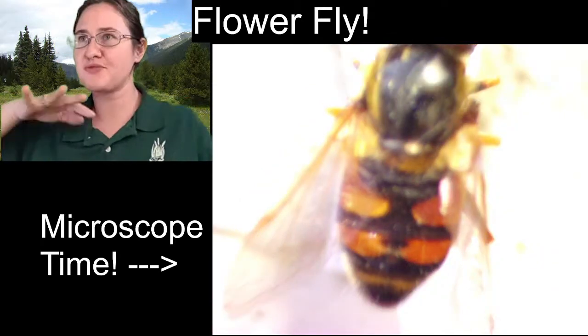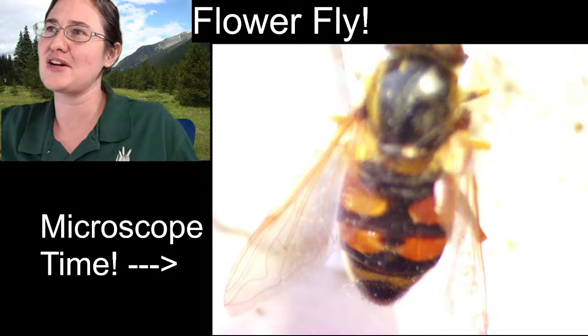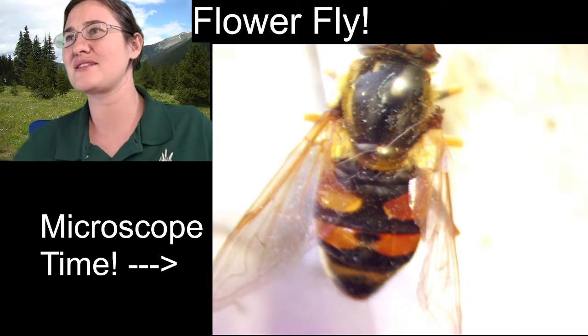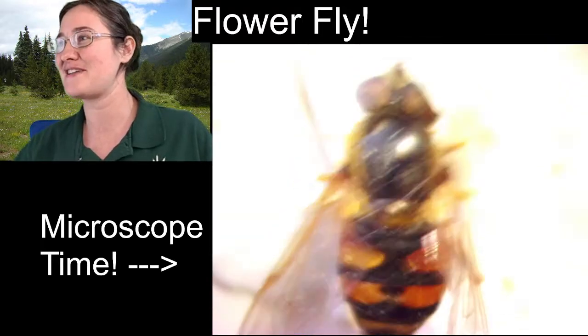I like viewing flies from a dorsal point of view. I know it's a little easier to do legs and stuff if we're looking at them laterally, but I'm a fan of this direction.